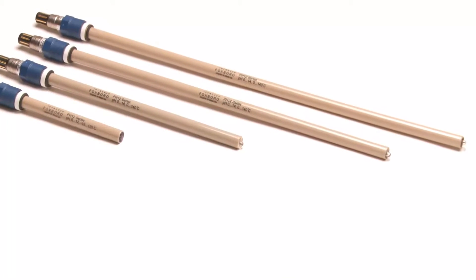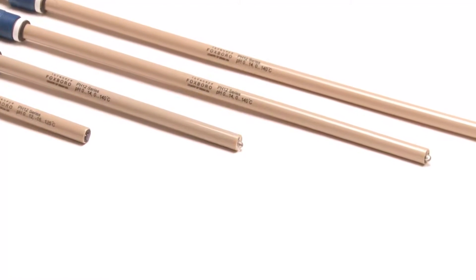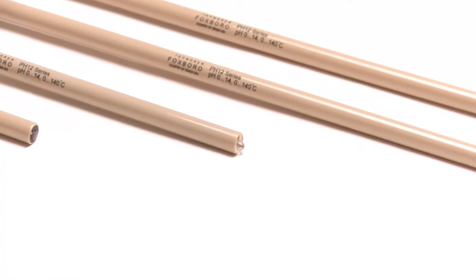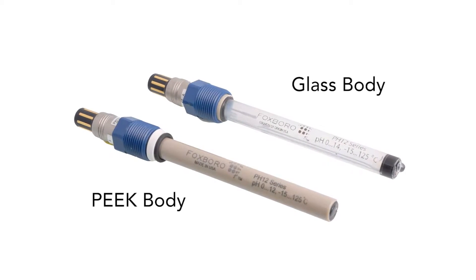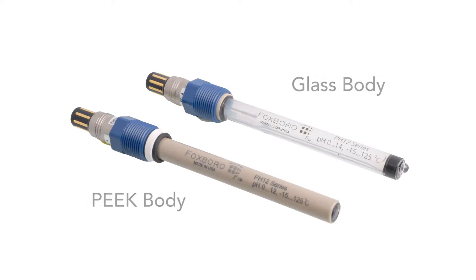Our latest release is a family of high-performance, disposable pH sensors in the widely used 12-millimeter form factor. The new Foxboro pH 12 series includes the process industry's first peak-bodied sensor, making it the most durable sensor available anywhere and provides the following advantages.